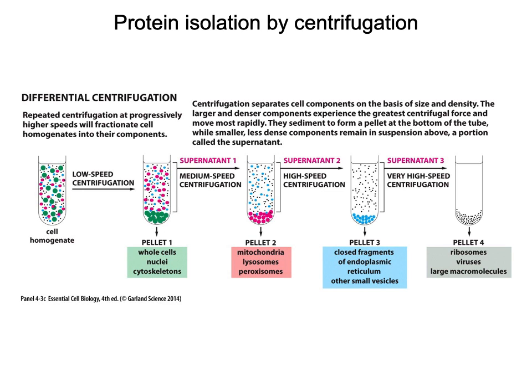Okay, so the other thing to keep in mind is that low speed centrifuges are cheaper than your high speed centrifuge. A high speed centrifuge has to be able to be balanced and spin fast enough in order to get that separation. And so the technology in order to do that costs more money. Okay, so most cell biology labs are definitely going to have a low speed and mid speed. Usually your high speed centrifuge is shared equipment in a lab space.